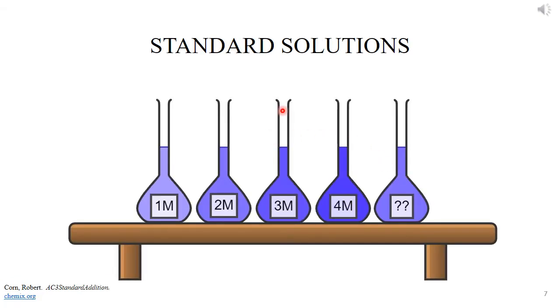There are two methods for determining the concentration of riboflavin using spectroscopy. Standard solutions is a method where solutions of different concentrations of the analyte are prepared and the fluorescence spectra taken. Then a linear curve of concentration versus fluorescence can be graphed. Taking the fluorescence spectra of the unknown solution, the unknown concentration can be determined by the linear curve.